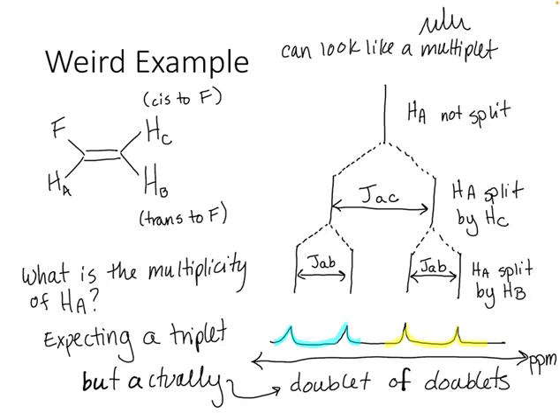All right, so now we're going to move on to chemical shift. So chemical shift is that ppm value, so where peaks show up on the NMR spectrum. So chemical shift is given a lowercase delta symbol, and there's actually an equation for chemical shift.